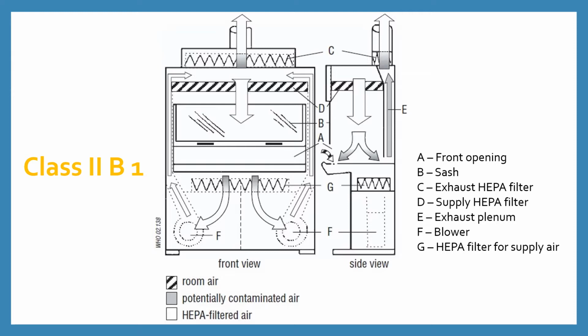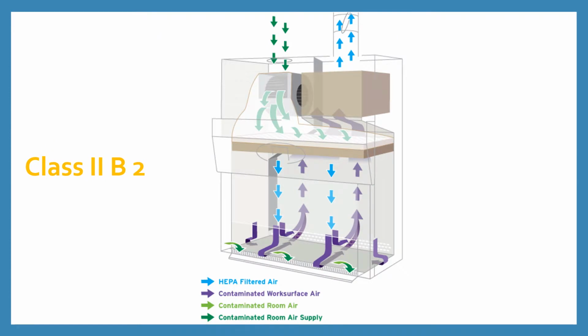Note that there are three HEPA filters in this class. Class 2 B1 type of biosafety cabinet provides personal, product, and environment protection. Class 2 B2 Biosafety Cabinet.